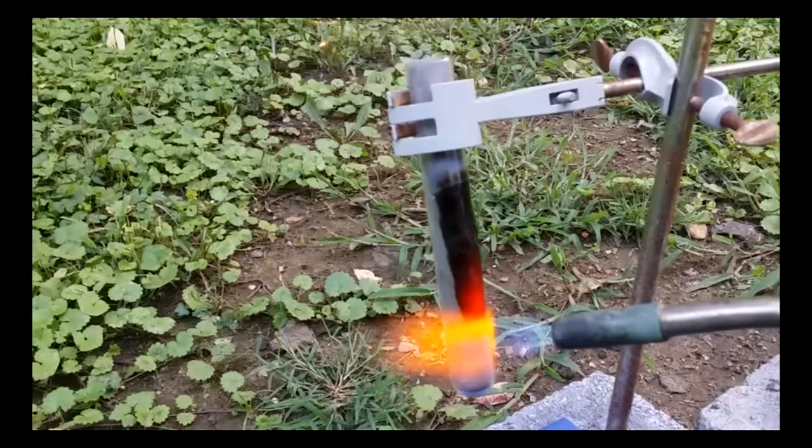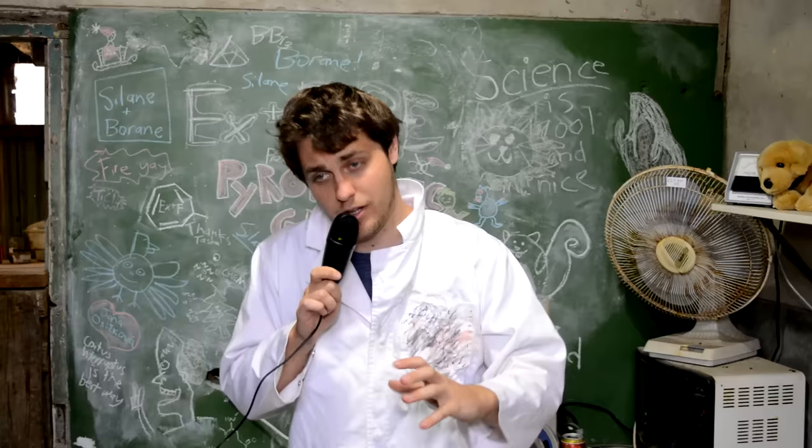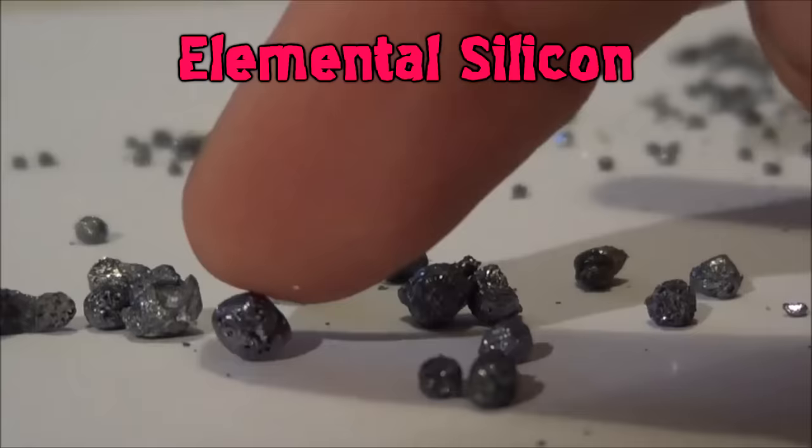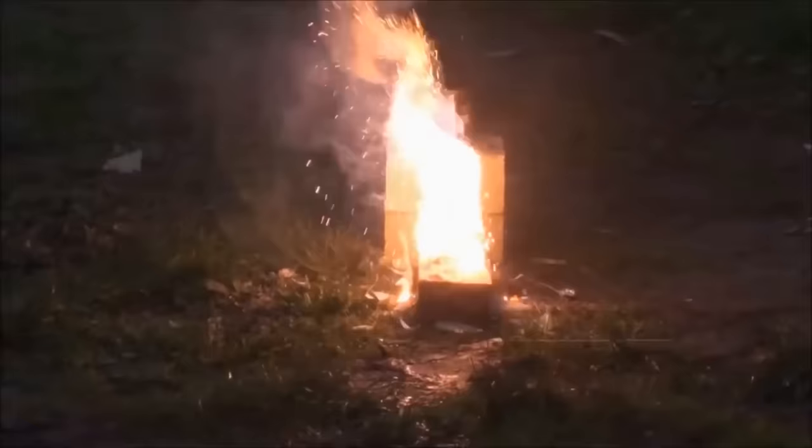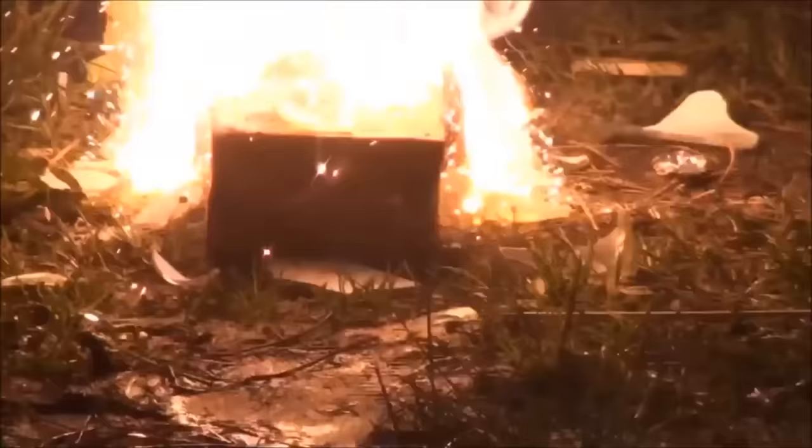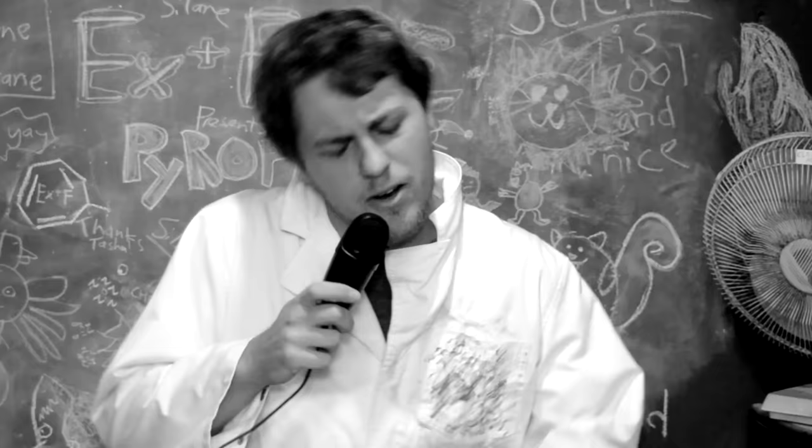Our other option is to use elemental silicon from the get-go and react that with magnesium metal and torch it until it reacts. I only have a very small amount of elemental silicon - it was forged in the heart of a dying thermite. It's probably one of the most beautiful products I've ever made, with lovely crystals in it. More than just physical beauty, every time I look at it I remember all the great times I had with my friends when we were making it. We had a great day together in simpler times. It's really just one of these chemicals that's very special to me.